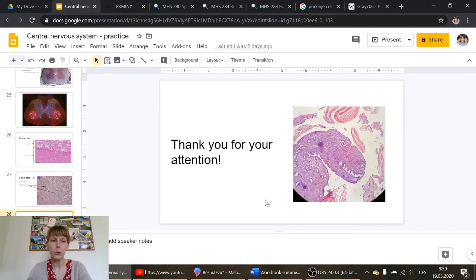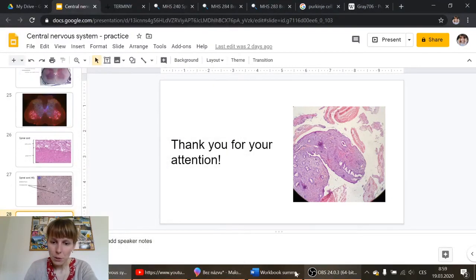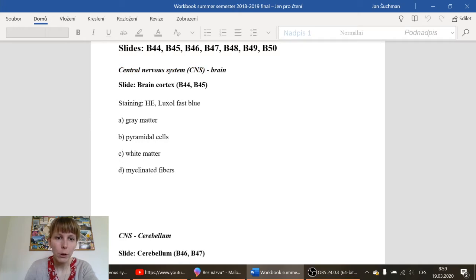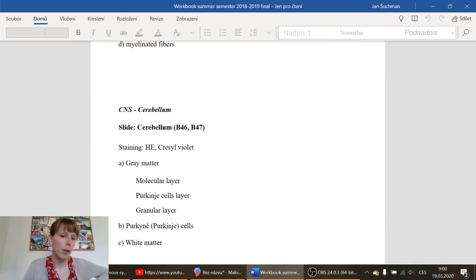So we got through the central nervous system. So we covered, let's review this, we covered the brain cortex, hematoxylin, eosin, and we saw gray matter, pyramidal cells, white matter, and myelinated fibers in cerebellum.